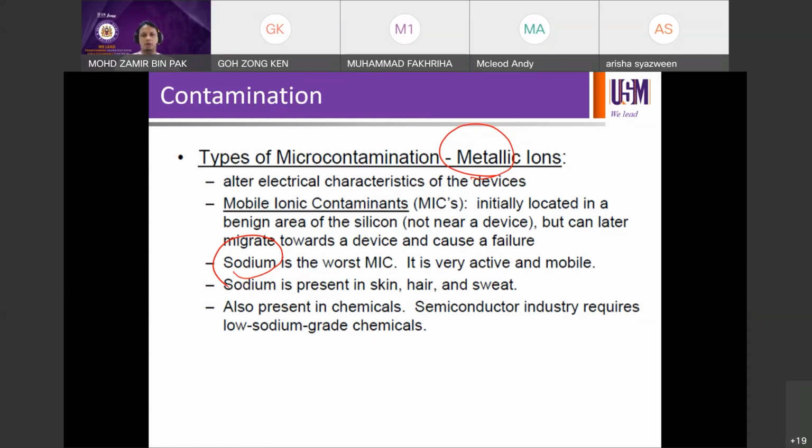So when you use chemicals, when you buy chemicals, you need to have the SDS. So data sheet, previously it was called MSDS, Material Safety Data Sheet, now SDS, Safety Data Sheet. So in there you have the content, do's and don'ts, you can mix this, you can operate at certain temperatures, everything spelled out in the SDS, right? So in there are details of everything.